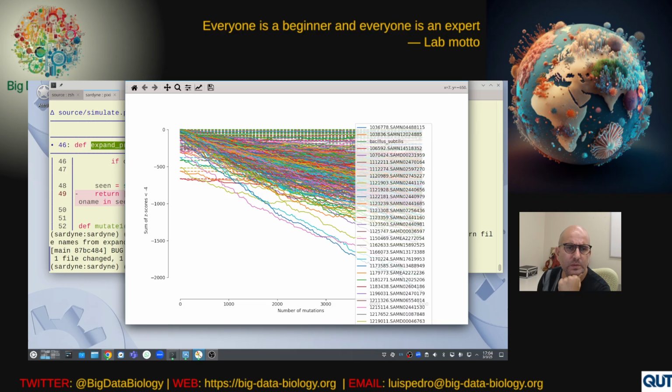But still, this would potentially lead us to a few false positives. These genomes here would be marked as not very good based on this metric, because they look much more like a genome with a lot of mutations than like a high quality genome. It could also be that these are genomes with a lot of mutations. Anyway, let's continue tomorrow. So far we're making progress.